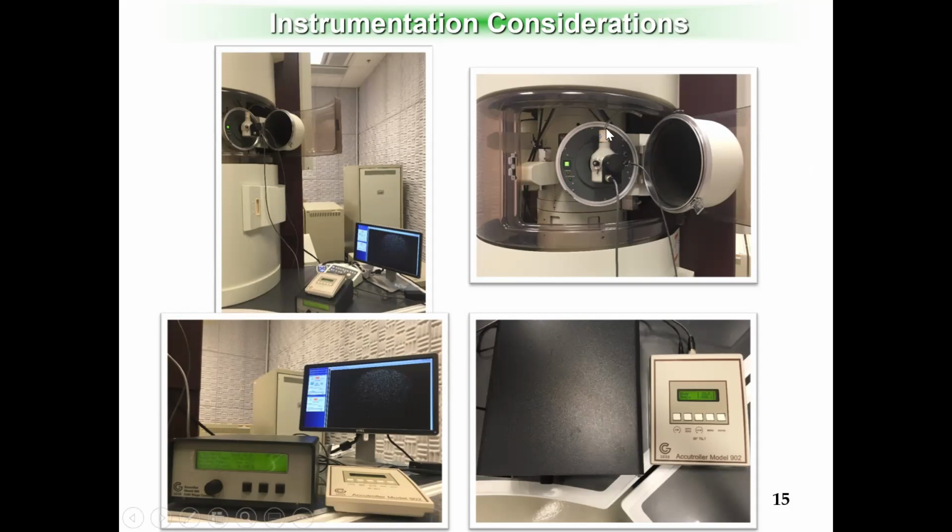Oh yeah, we have it on the surface of the liquid nitrogen, then we can just extract the bubbles out through this tube. Right? This way, of course, we have to sacrifice some of the liquid nitrogen itself, but at least we can extract out most of the bubbles so that there will be very small vibration on your final image taking. Perfect.